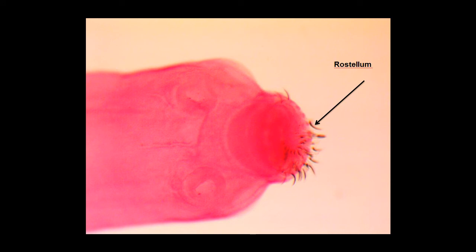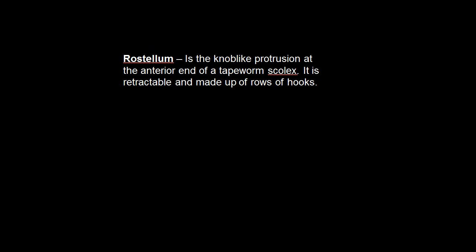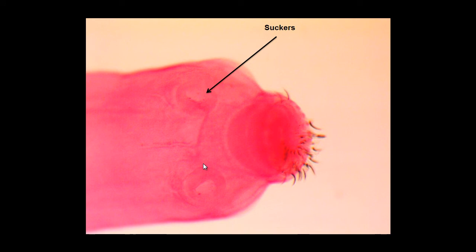Here is a picture of the rostellum showing the multiple rings of hooks. The rostellum is defined as the knob-like protrusion at the anterior end of a tapeworm scolex, retractable and made up of rows of hooks. Here we can also see some of the suckers that help anchor the scolex inside the intestine.